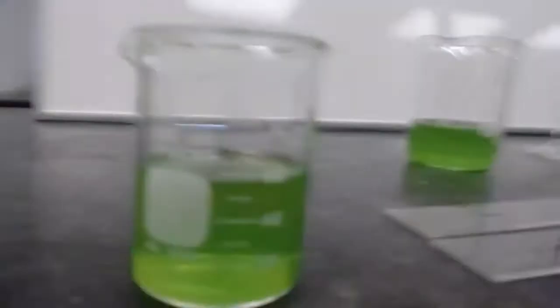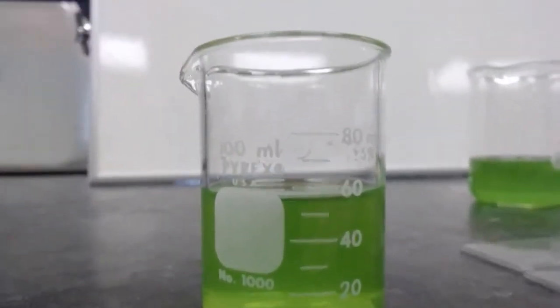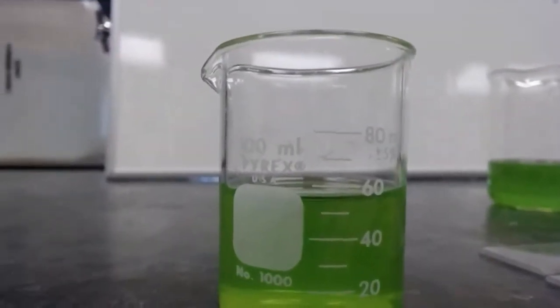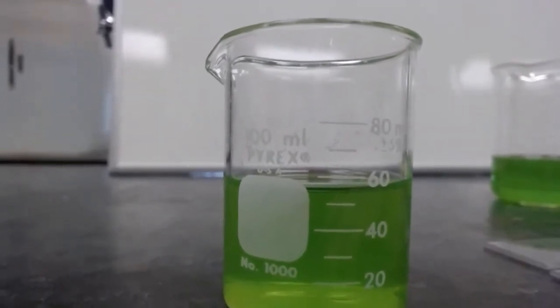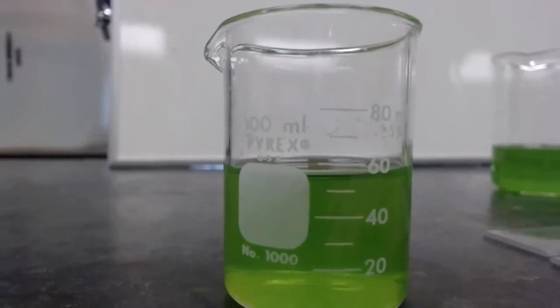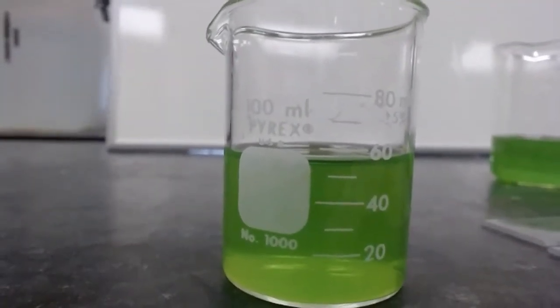So if we look at it, we can see that it is closer to 60 than it is 50. And so I'm going to guess that it's a little more than halfway. And so I'm going to guess that it's 57. That's estimating. You may estimate that is 58 or 59 or 55.